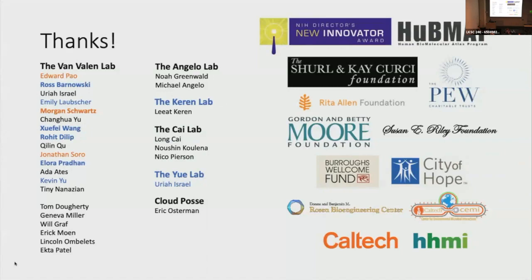There's a few questions in the chat. One of these I think is a good one. How do the CNN-based models deal with autofluorescence? Throw enough data at it. There are 2 ways you can do it. You can subtract out the autofluorescence yourself and make it easier for the model to deal with, or you can just throw a bunch of data at it, and some of it is autofluorescence but correctly labeled, others has real signal and also correctly labeled. What we saw with Mesmer is that once you have enough data, it stops mattering whether you've done the autofluorescence subtraction or not.